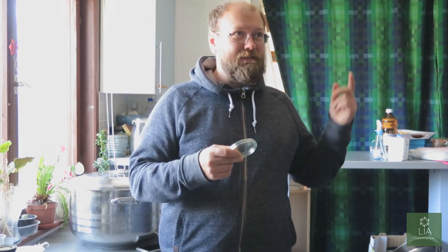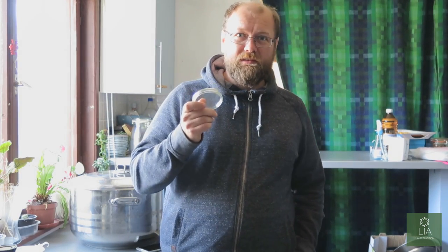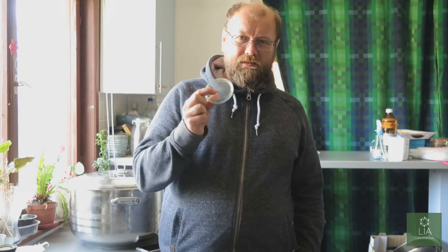Okay. Right, now we've found our samples of mycelium outside in the woods, we're going to transfer these into petri dishes. So we're going to create an agar mix, which will feed the mycelium inside these little petri dishes. So we're going to have agar, and we're going to add brewer's yeast. We're going to mix that up in a pan, then we're going to transfer that into a jar and sterilize it in the pressure cooker.